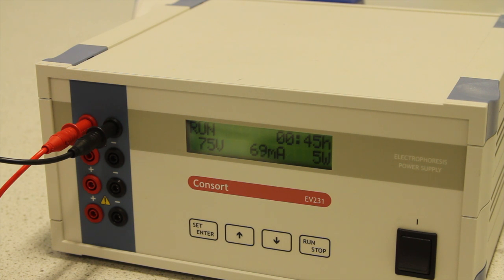The display will change to run and the voltage will increase to the level set. The display will also begin to count down from the time set. The gel is now left to run to allow the DNA samples to migrate through the gel, separating according to their size.